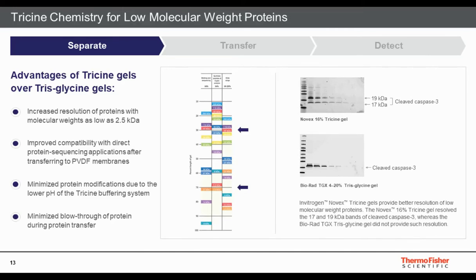A similar story applies for low molecular weight proteins using tricine gels, which can separate proteins down to 2.5 kDa. When looking at caspase-3 and its cleaved forms — a 17 kDa and a 19 kDa protein — the tricine gel clearly separates and resolves these bands for independent detection and quantification, whereas on a tris-glycine gel, separation of those closely spaced bands is difficult and clean resolution is not achieved.